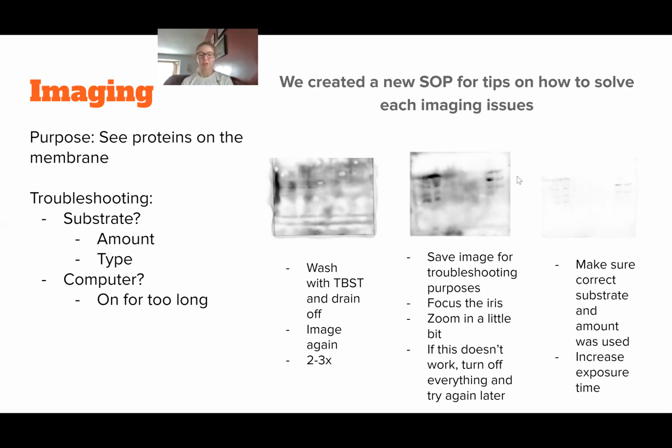So pico is used for things like beta-actin or blots that have a very new primary. You want to use it for blots that have a very new primary, because that primary is so strong. You don't need a strong substrate in order to see that image. You don't need that to get a bigger, better signal. So you would only use pico for things that you need to image for about 60 seconds or less. Even that's kind of really high.